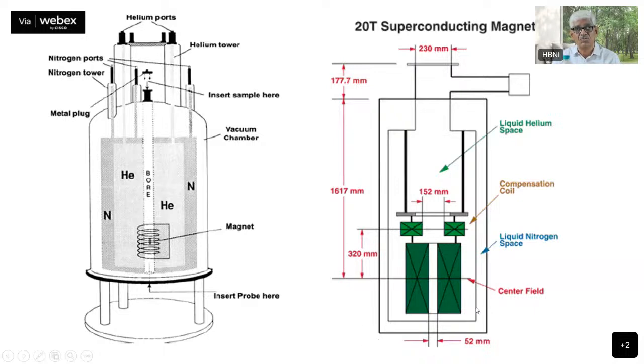Typically they go to about 1 or 2 meters, but today the insulation and the shielding has become so effective that even that is actually quite substantially compensated, and you don't have the stray fields far away from the magnetic center. So this is about the magnet.